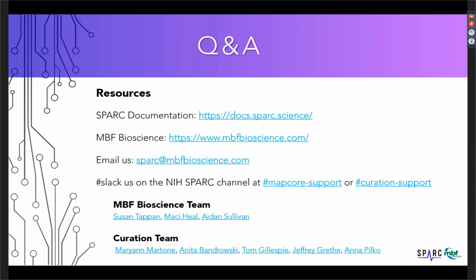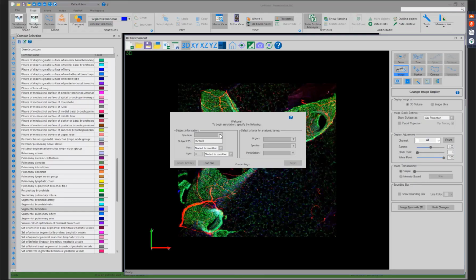All right. So Maurice, I may be hopefully saying that right, asks, what species are already available for segmentation, and is it possible to request new species to be added? I'm going to flip to the species that we have already that we query. This is Sue Tappan. So we've built this list of species based on the known information that we have from current SPARC researchers. So if you are a SPARC researcher and you need an additional species added, reach out to us and we'll work with the curation team to get that added. We definitely want you to be able to manipulate and record the data and access the term lists that are necessary.